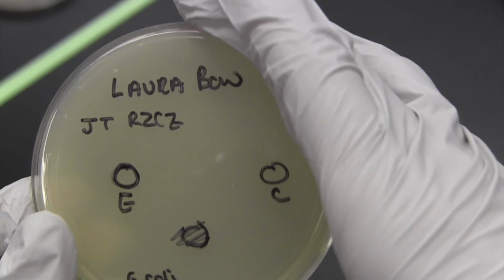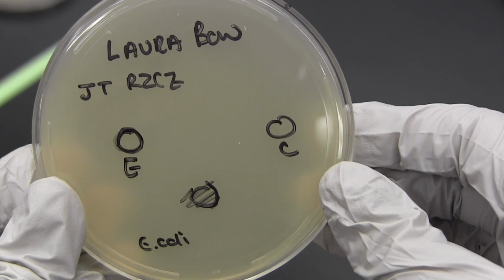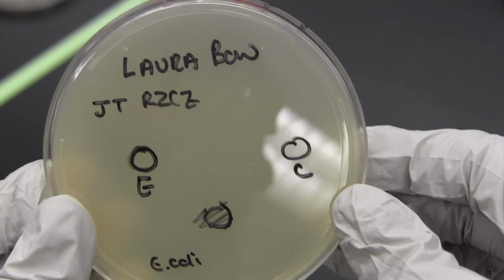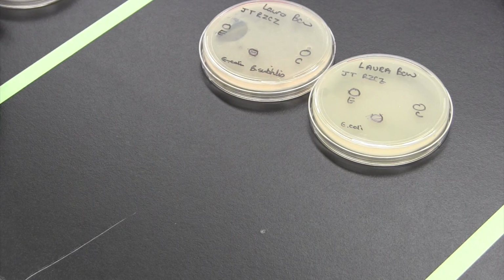But interestingly, that same isolate did not show any activity of the chemical extract against E. coli. So again, you're going to have varying results depending upon the tester strain that you're using in your agar overlay, as well as the initial bacteria that you're working with.